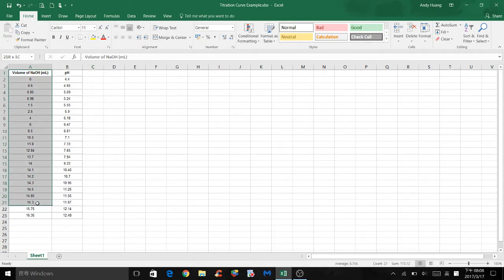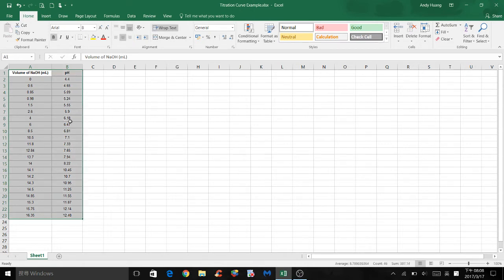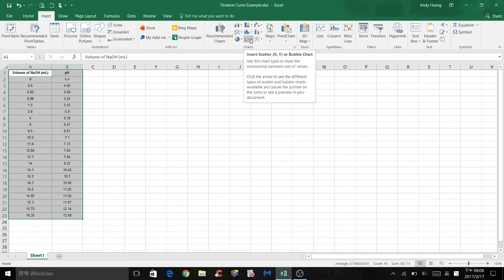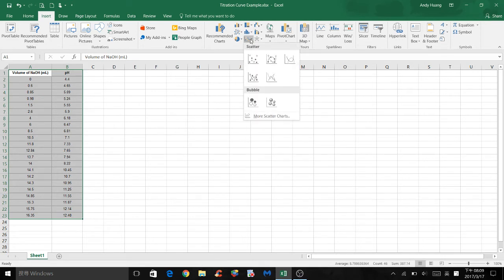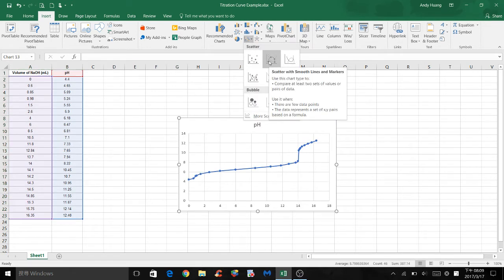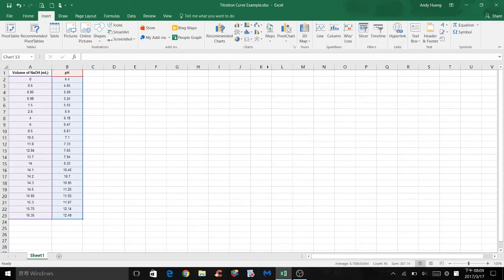Select all the values first, click insert, click on the icon for scatter plots, and select scatter with smooth lines and markers.